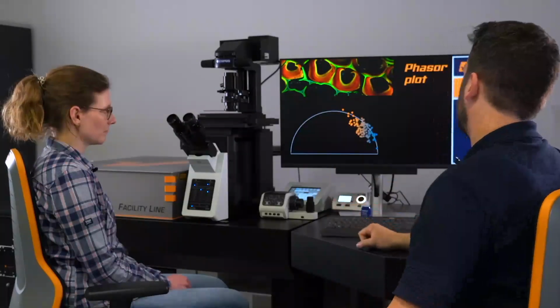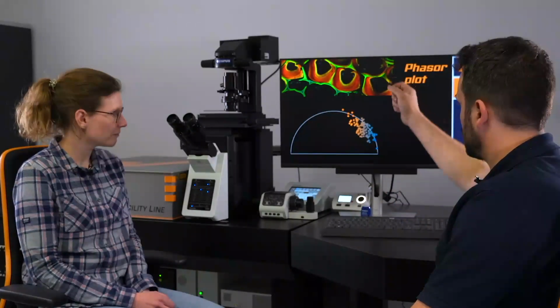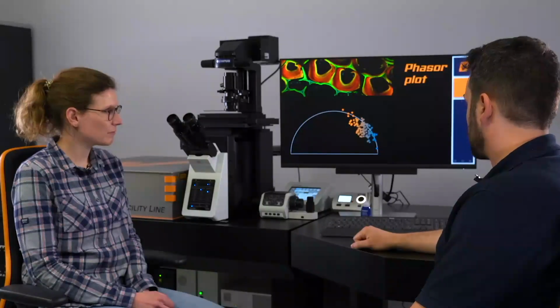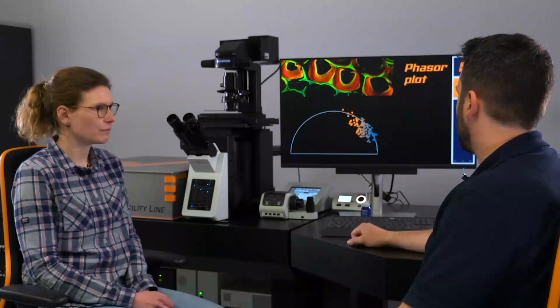In the phasor plot on the bottom, we can see the phasor plot is basically a large semicircle, and in that semicircle we have multiple dots. Every dot represents basically a pixel in the image here on top, and the position of that dot within the phasor plot represents the lifetime value of that pixel.